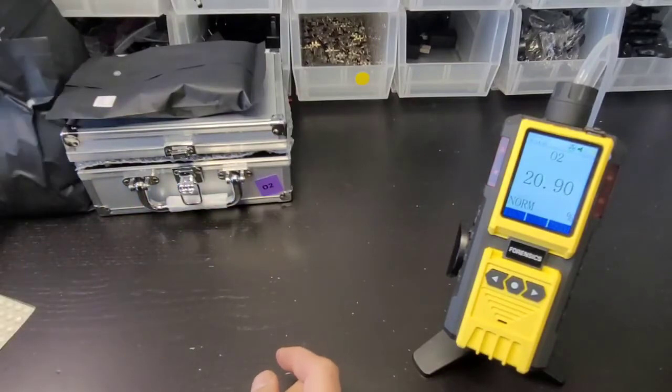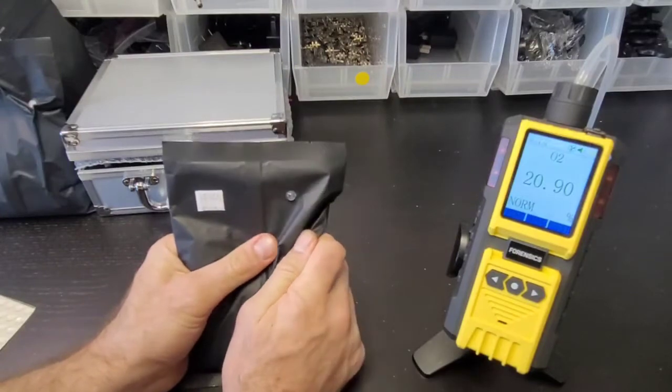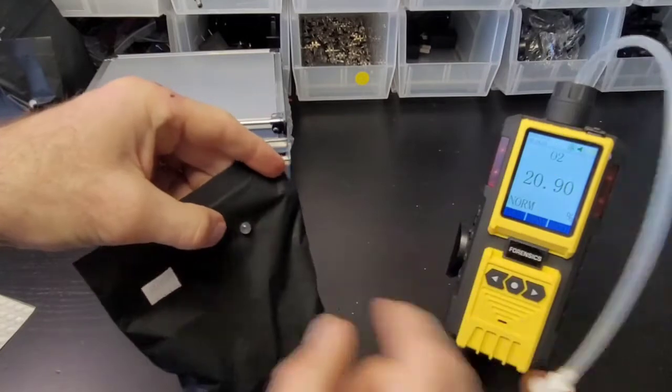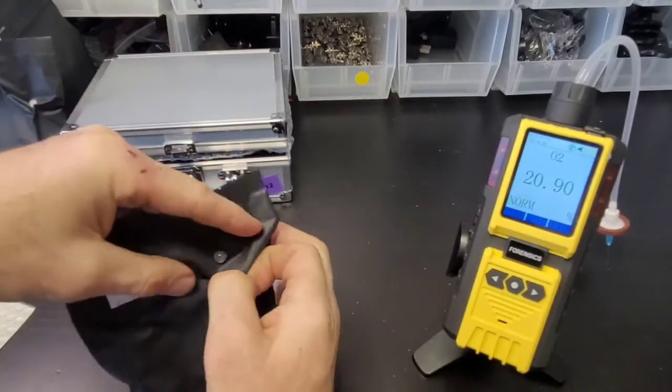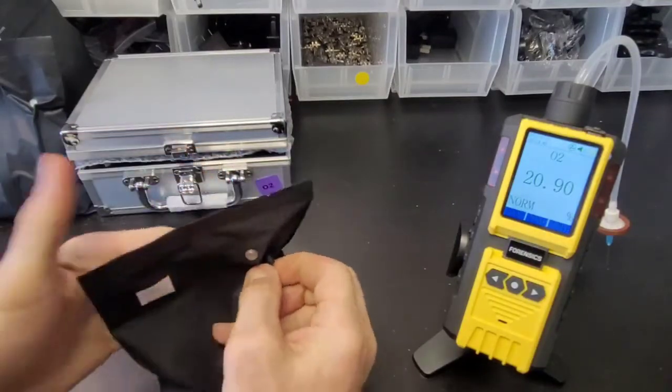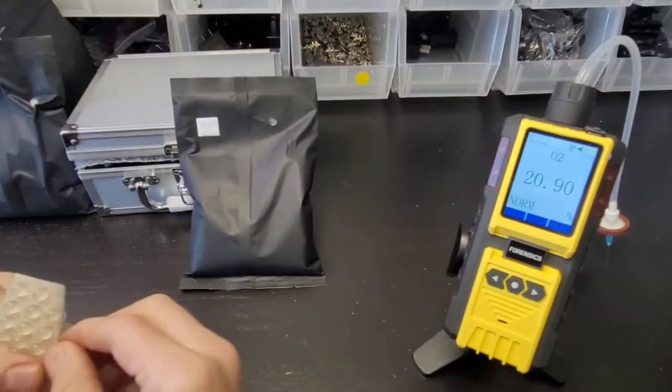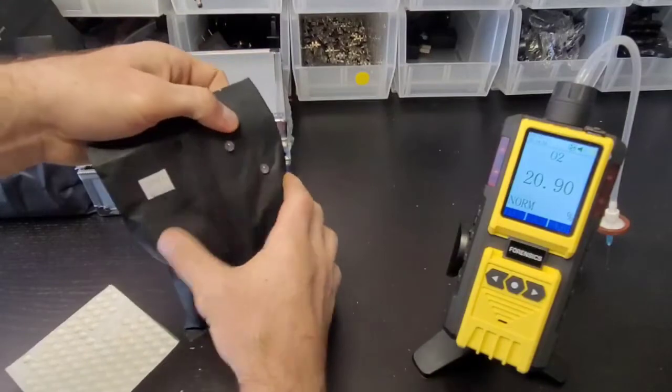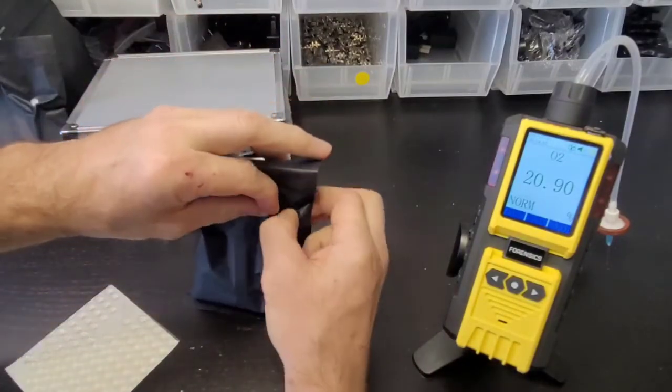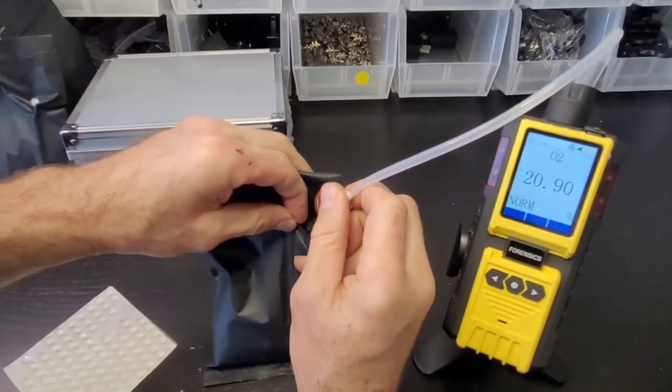The last package here has a little bit more headspace, so this should be a bit easier than the prior pack. I'm going to pop another septa right on this corner here - seems to be where the interface between the coffee and the headspace is. That will make it easier for me to pop the needle through.